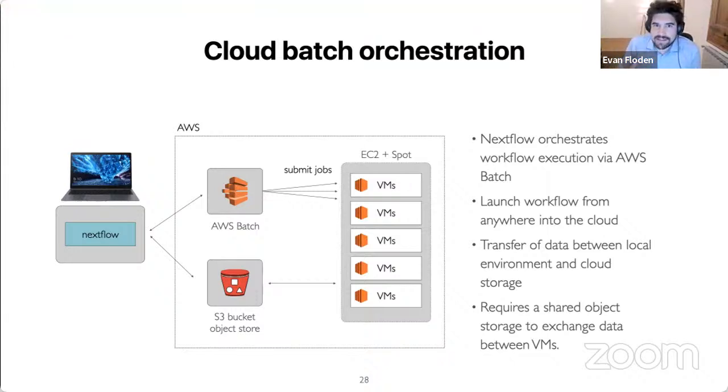The great thing about this is that you can spin up resources as you need. So maybe data's coming off a sequencer, or you've got a whole bunch of analysis you need to run at one time. Maybe you need to access GPUs or some very large memory machines. And all of that can be done now by splitting up those resources on demand for those jobs as well.